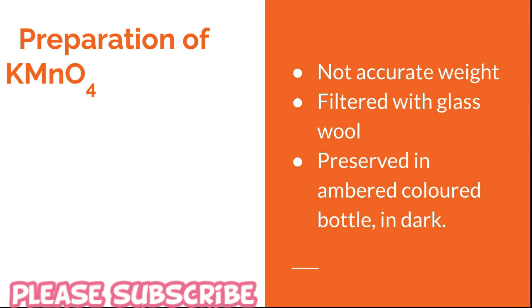The second point is, if we try to filter out that MnO2, we cannot use ordinary filter paper because the filter paper will be oxidized and the filtration will not happen at all. So we will use glass wool to filter the KMnO4 solution.